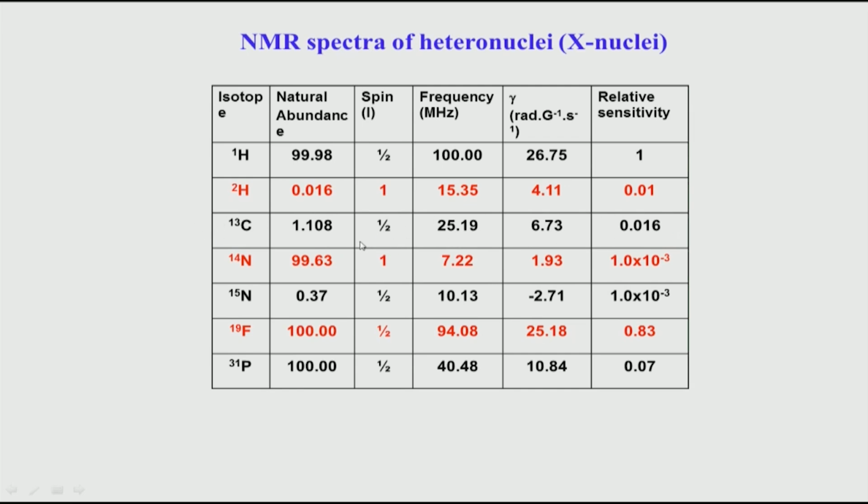So, let us look at how proton carbon 2D experiments can be done and how we can improve the sensitivity of carbon, so that the spectrum can be recorded in a reasonable amount of time. These are basically the three problems which do not favor many nuclei. One of the most important two factors, as we saw, is gamma value and natural abundance. If natural abundance is low, then sensitivity is less, and if gamma is low, the sensitivity is also low. So, compared to proton, these are the factors which make it less sensitive for X nuclei.